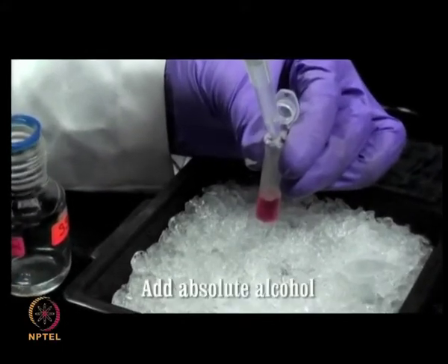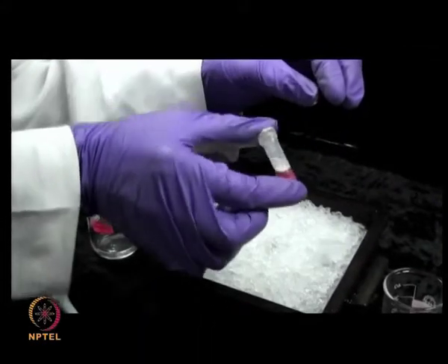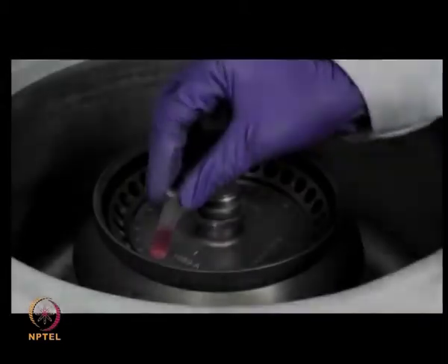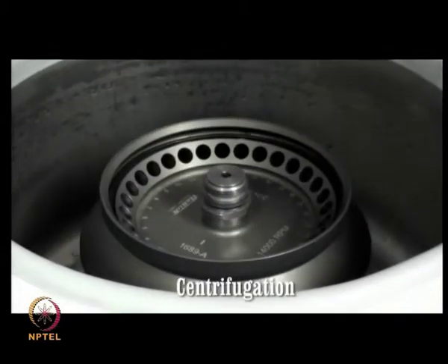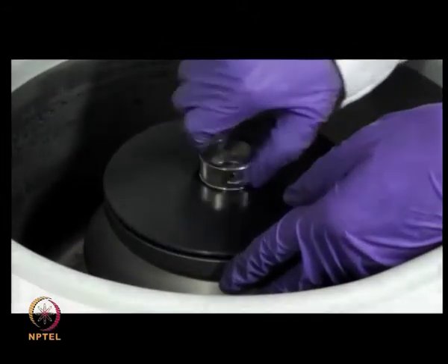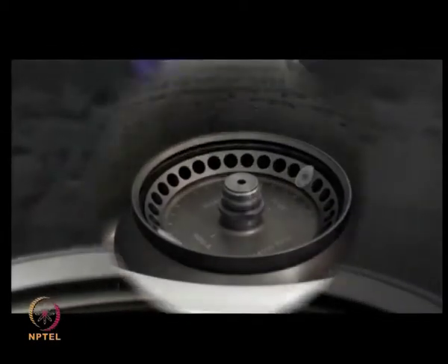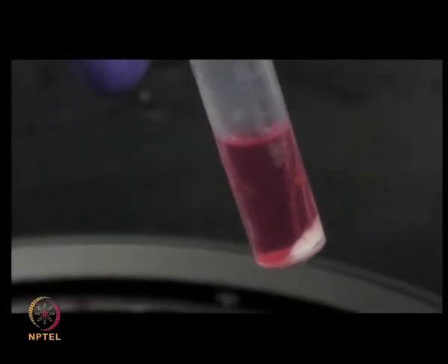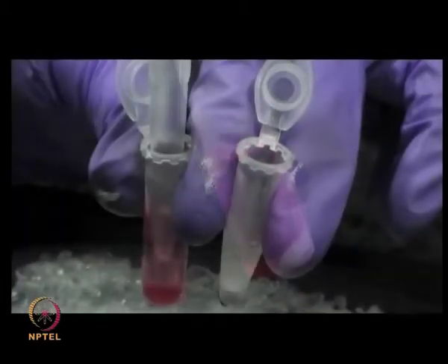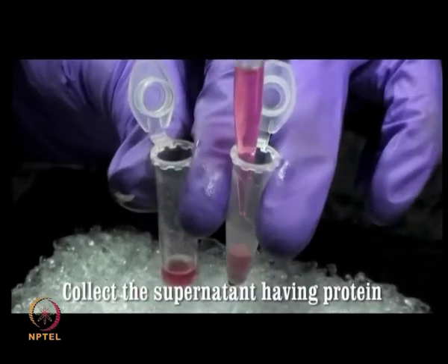Then, add absolute alcohol to the remaining layers and mix the solution well. Centrifuge the contents at 2000 rpm for 5 minutes. The DNA forms a white precipitate at the bottom of the tube, while the proteins remain in the clear supernatant. Collect the supernatant in a fresh tube.